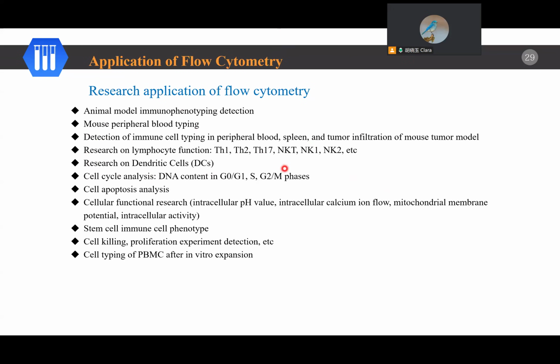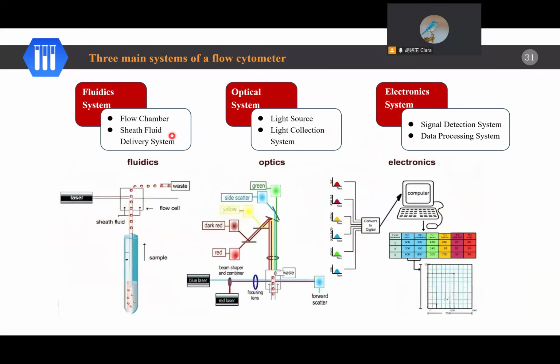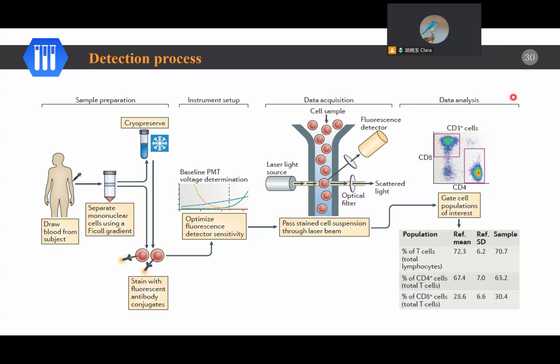We learned the main parts of the machine, the principle of the optical system and the digital system, and also how to analyze the results. To summarize, I'd like to show you the whole procedure.